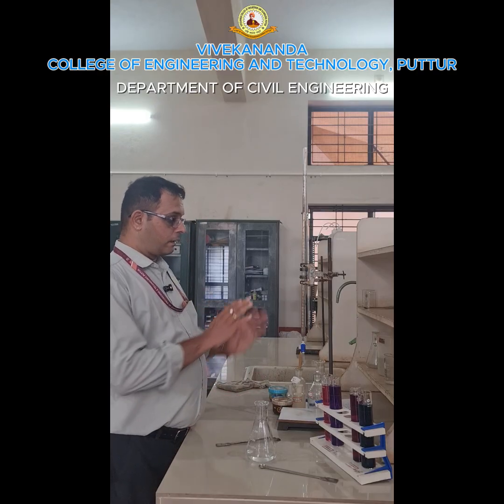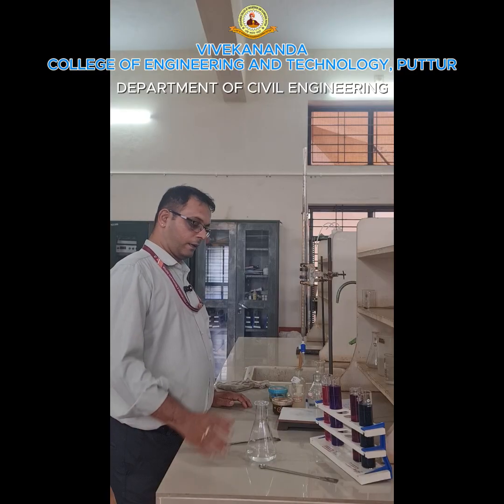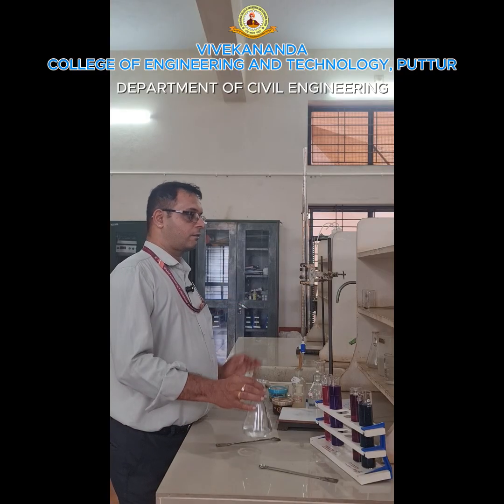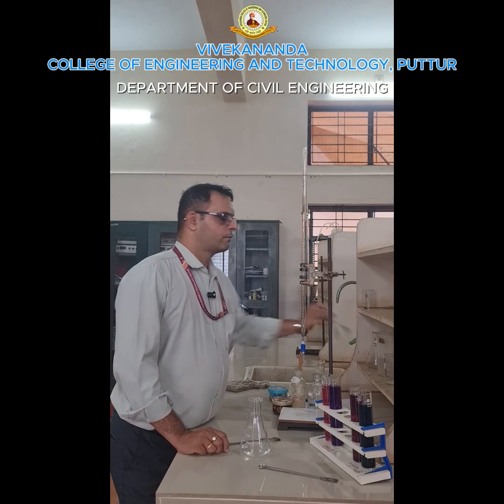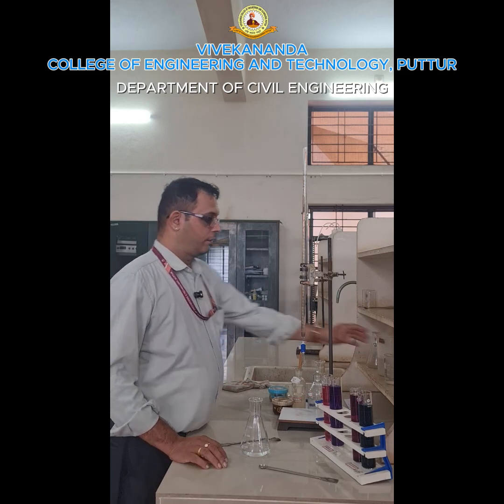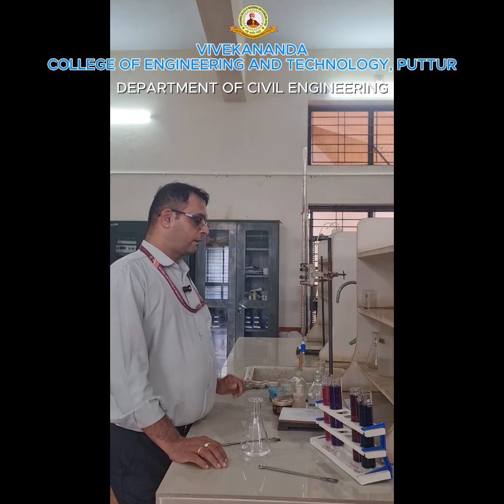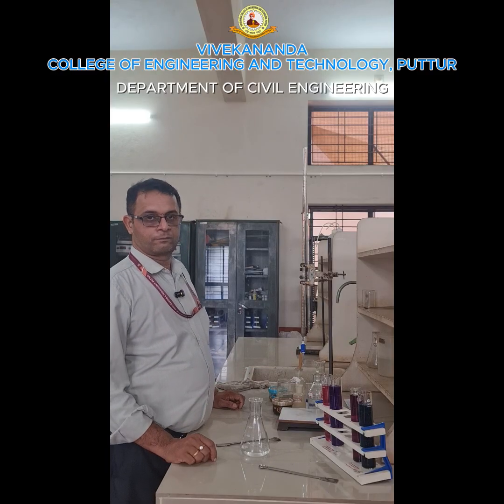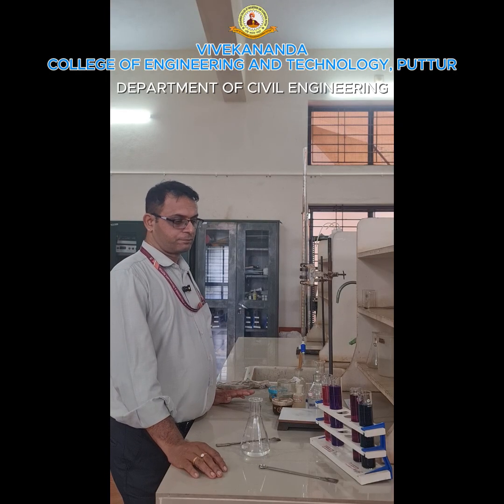The chemical contents we have seen. Now what are the other accessories we require? We require conical flask, burette, funnel. Then we require a heater, beaker, then pipette. So these are the total setup which is required.